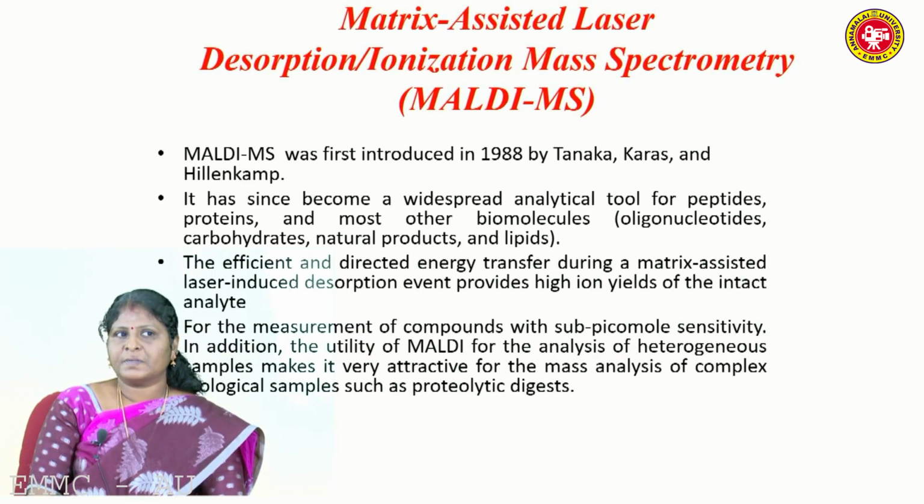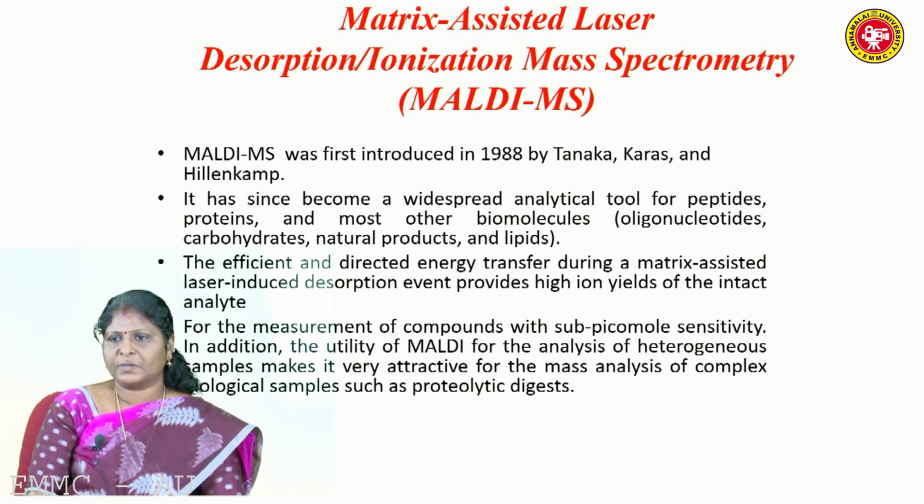Matrix assisted laser desorption ionization mass spectrometry, MALDI MS, was first introduced by Tanaka, Karas and Hillenkamp in 1988. It has since become a widespread analytical tool for peptides, proteins, and most other biomolecules like oligonucleotides, carbohydrates, natural products, and lipids. The efficient and directed energy transfer during matrix assisted laser desorption provides a high ion yield of the intact analyte for the measurement of compounds with sub picomole sensitivity. In addition, the utility of MALDI for the analysis of heterogeneous samples makes it very attractive for the mass analysis of complex biological samples such as proteolytic digests.